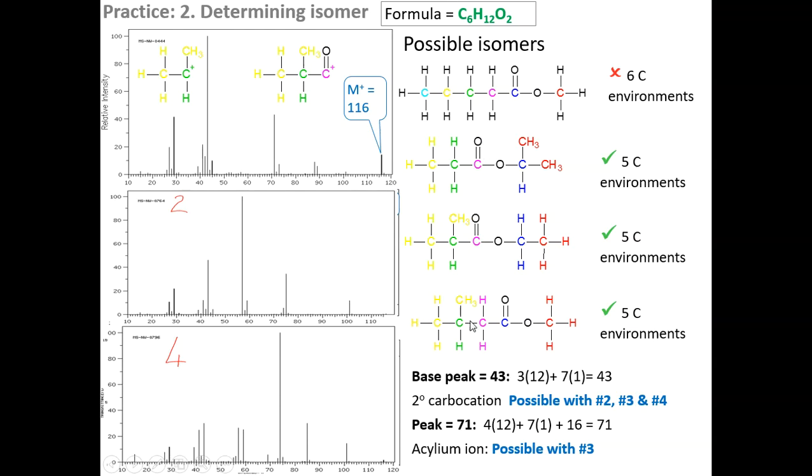And then for this one, our base peak is over here at 74, and that is this particular where it breaks again over there, but we've got that extra CH2 on it. So hopefully this helps. Kia ora.